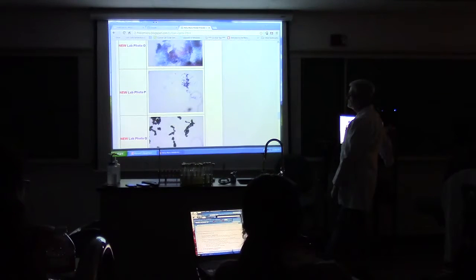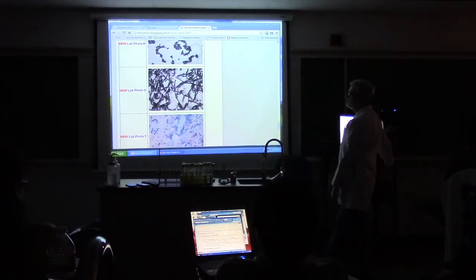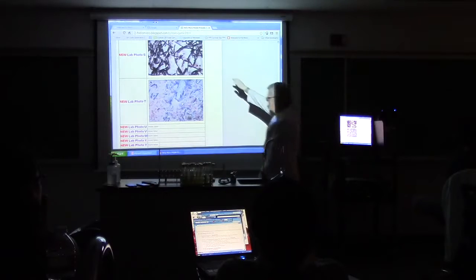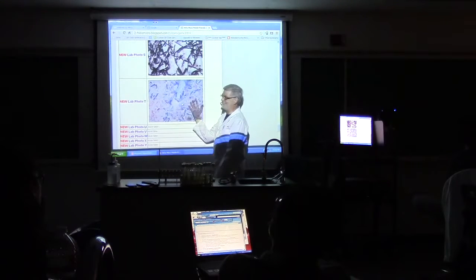This is gram stain of smegmatis, a few pink, and lots of purple. Gram stain of Staph aureus or Micrococcus luteus, blackish purple. Blackish purple with pink underneath on the gram stain of Bacillus. And here is the one that's going to screw you over on acid-fast. These are both Bacillus megaterium. This one, the cells are baby blue, and the endospores are hot pink. So this is acid-fast negative.